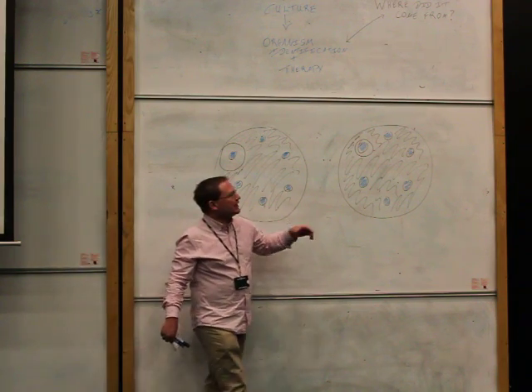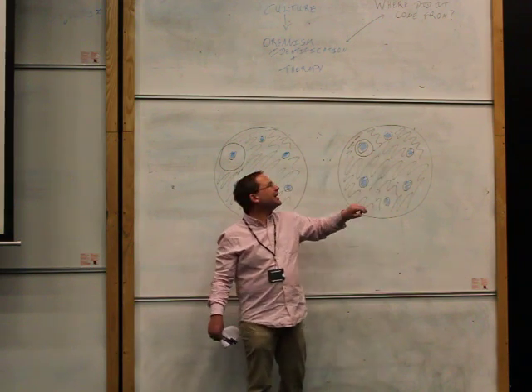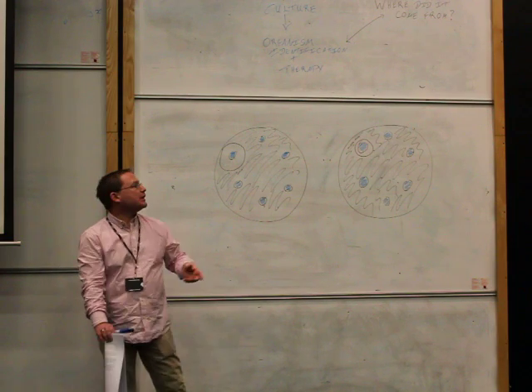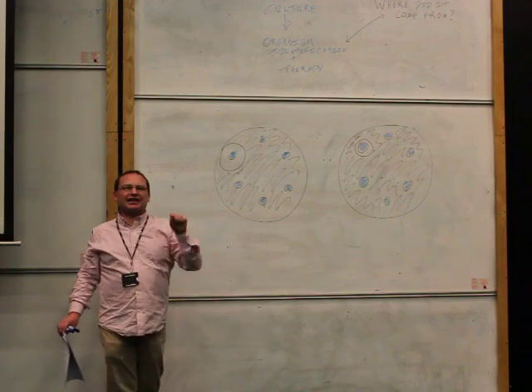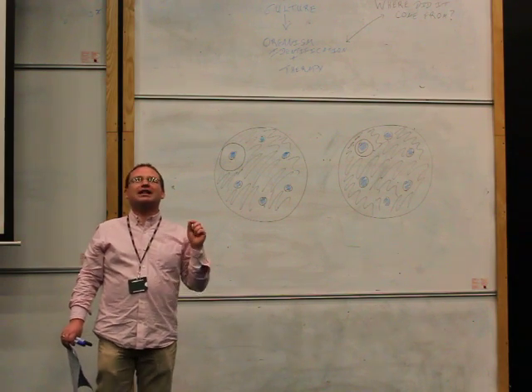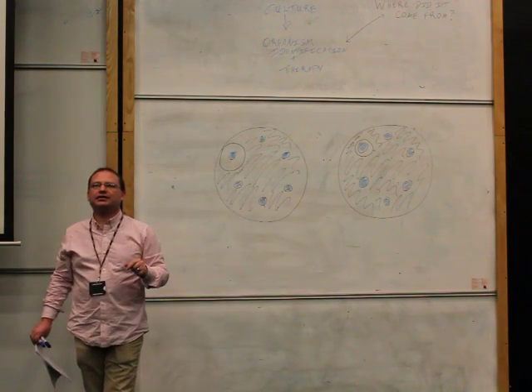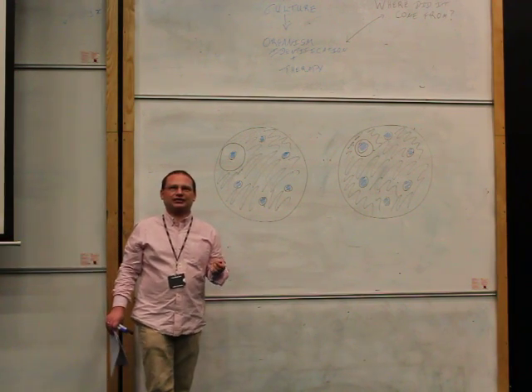You then need to look at your test plates. So we have the organism here and the same antibiotic disc. Again, measure across the diameter of the zone of inhibition and compare the size of the two. Now, if the zone of inhibition of your test is equal to or greater than the zone of inhibition of the control, it must be sensitive. Because this is sensitive, if it is equal to or greater, then that one must be sensitive. If it is smaller, it is resistant.